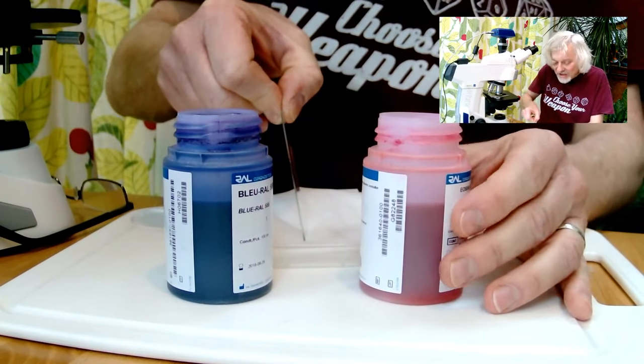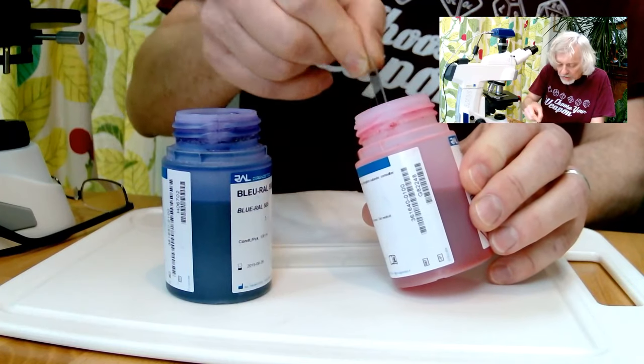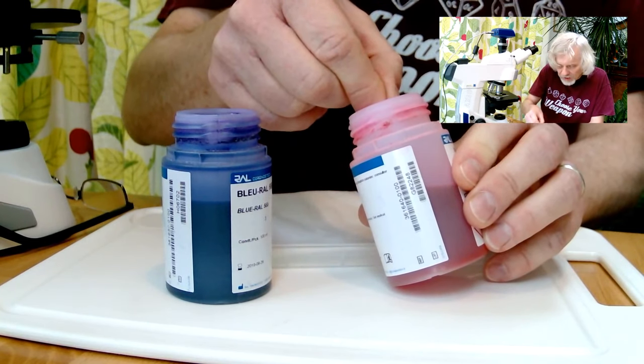This one is called eosin. That one we go in. One, two, three, four. I do this one nice and slowly.